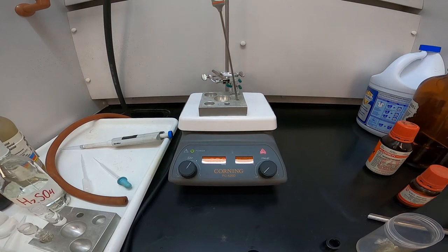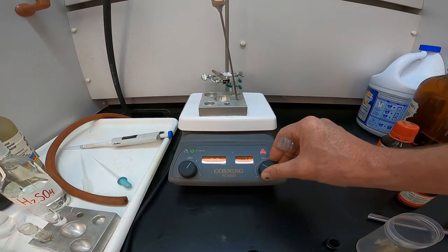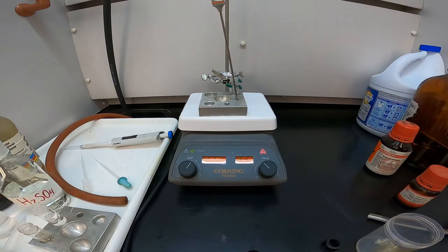All right, so for the purification process, what I've actually done is I went through and did 2 more additions of ether and a few more additions of sodium bicarbonate and extracted those layers to add to our unpurified product vial. Then, because the ether is very volatile, I put it back on the hot plate. The hot plate's still at about 90. If I look at my thermometer, about 95, and that allowed all the ether to evaporate away, but the product boils at a much higher temperature, so it didn't dry away.